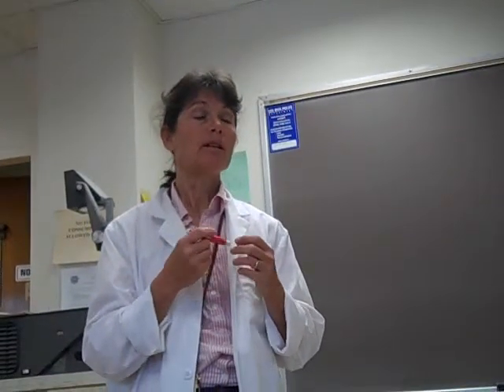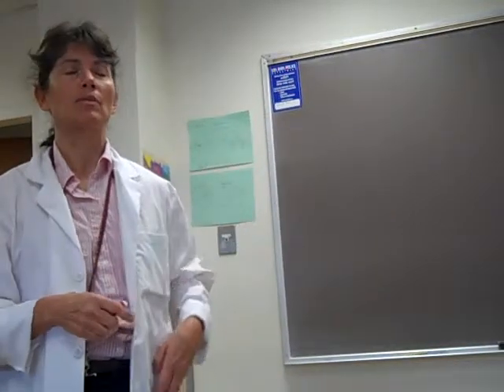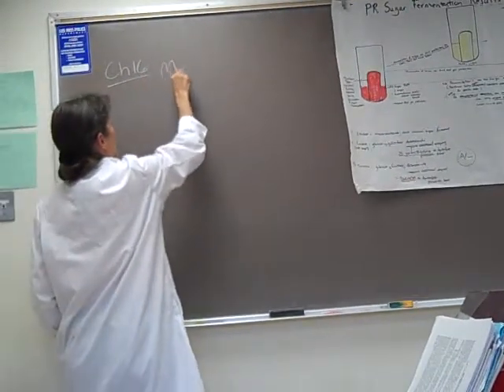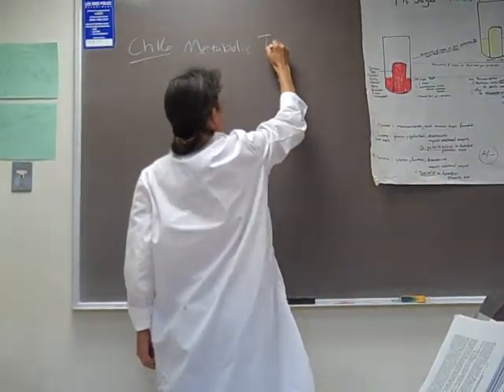We're trying to figure out which enzymes our different microbes can produce. And what we're going to do to help us identify these enzymes, we're going to incubate our bacteria with different types of media, different types of substrates, and we'll look for production of end products, or we'll look for production of unique intermediates to help us identify indirectly the enzymes our microbes are making. Okay, so we're going to start then in chapter 16. This is often referred to as Metabolic Test Part 1. We're going to introduce you to some really fun metabolic tests.